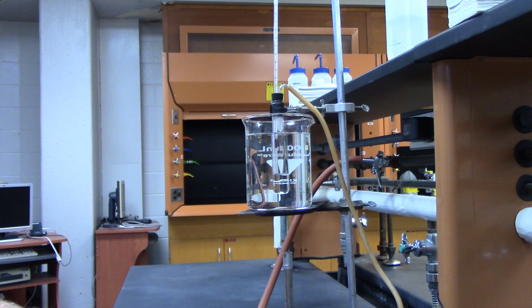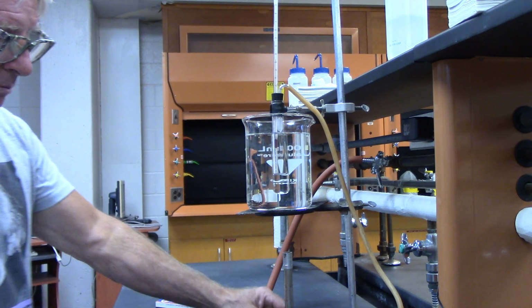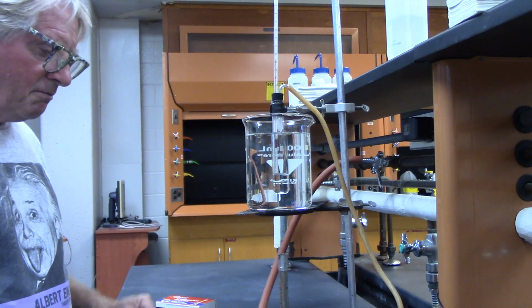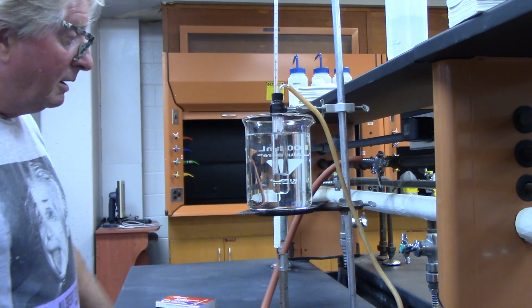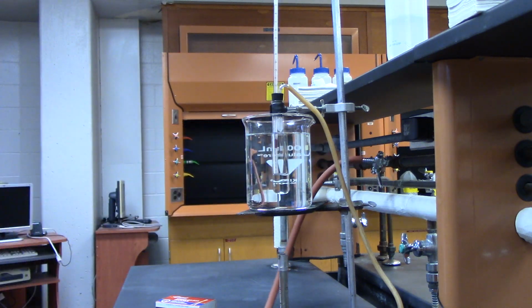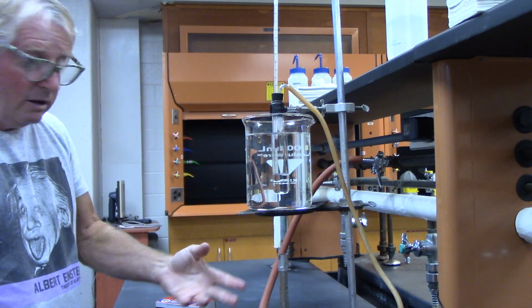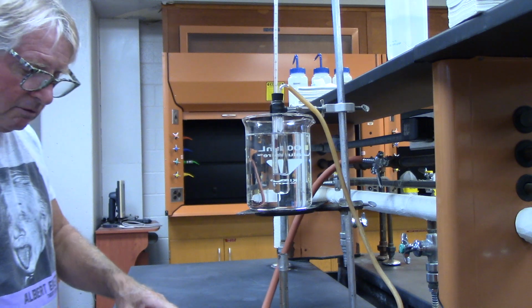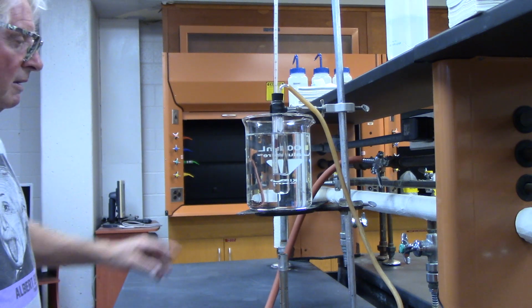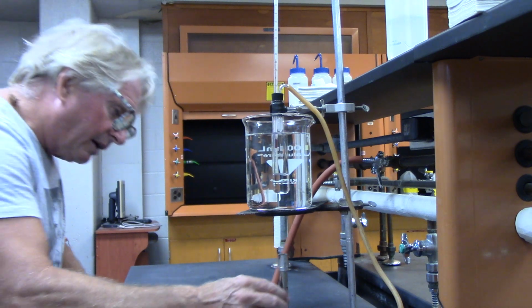Turn on the Bunsen burner. The Bunsen burner has two components. It has a gas inlet. This is natural gas, which is methane and ethane; that will be on our first test. The other component is air or oxygen.